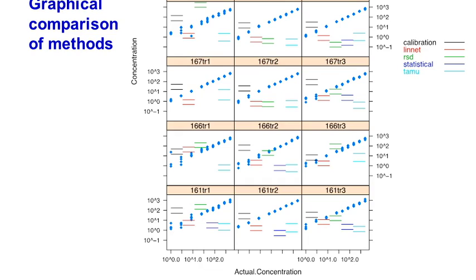In some cases actually I think it can be really low. So the RSD method is not very robust and could result in wild changes in some situations. So I think it depends on the behavior of the peptides. If the standard deviation is actually very well behaved and increases properly, then it works reasonably. Otherwise, it doesn't.